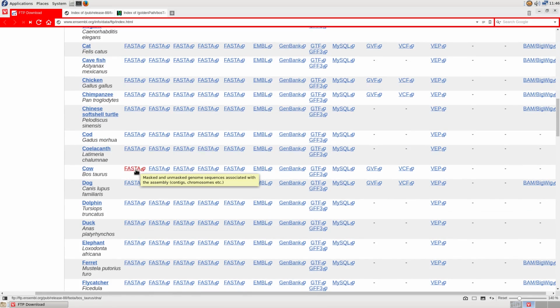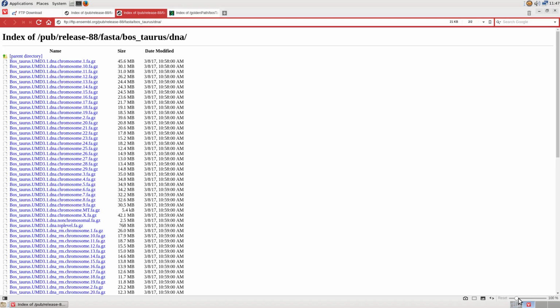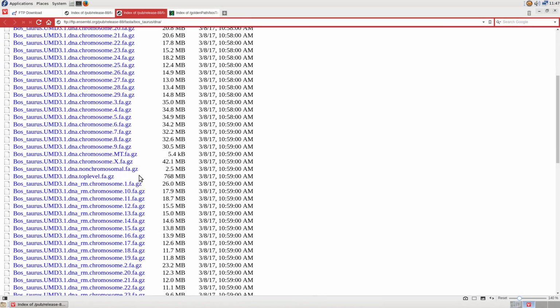So if we click on this link for the genome sequences, it brings us to an HTML page with the links to each individual file. There's a FASTA file for each chromosome. If we're interested in downloading the entire genome, as in the previous example for the novel microRNAs, when we do the mapping to the reference genome, we're mapping to an index made up from a sequence file with all the chromosomes, which is this file here. So if you're interested in doing this, this is the kind of file you need.